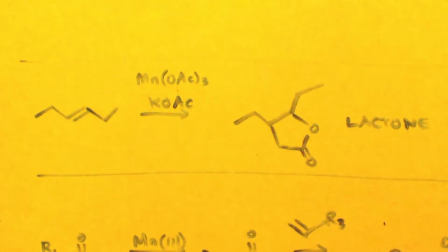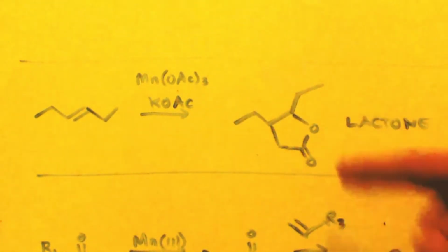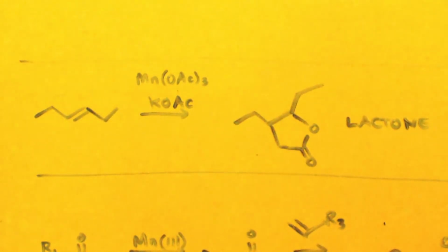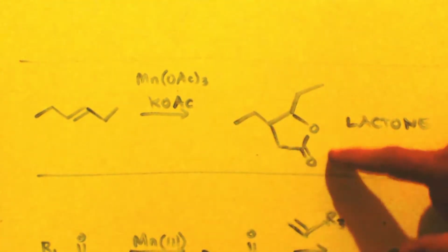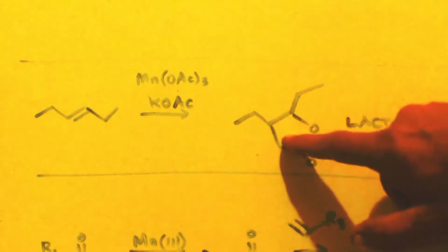And acid, you'd have to have some acetic acid to react with that. And you can see the acetic acid is right here. There's 1 carbon, 2 carbons, and here's the carbonyl group. And these bonds, that's where the double bond came. Double bond flipped up, flipped up.